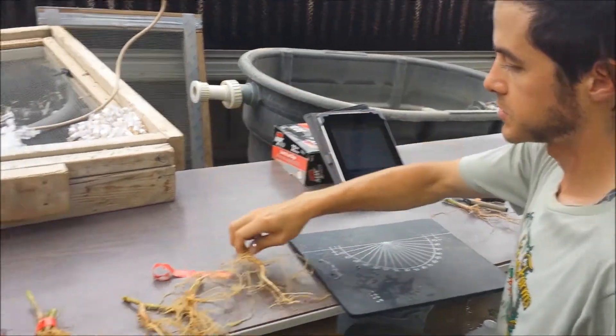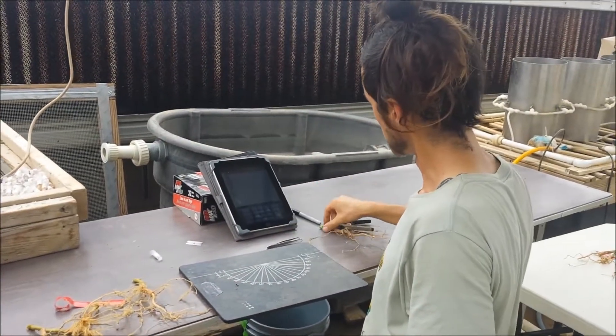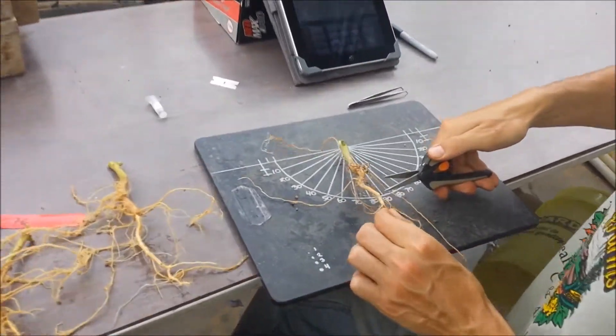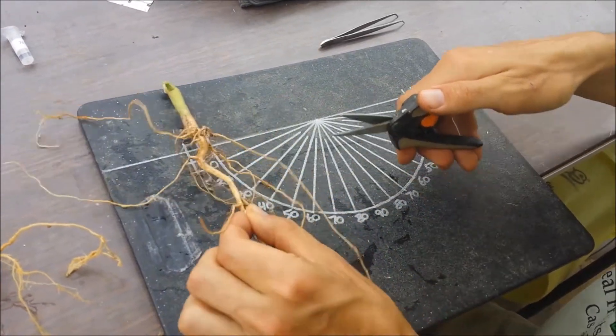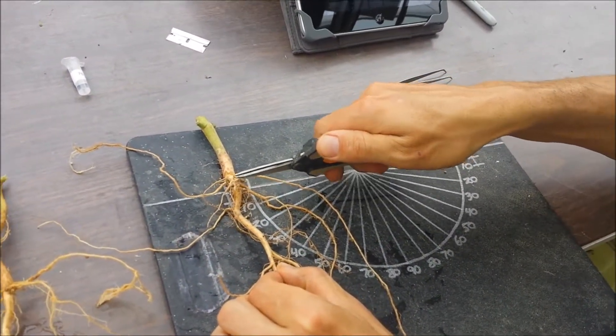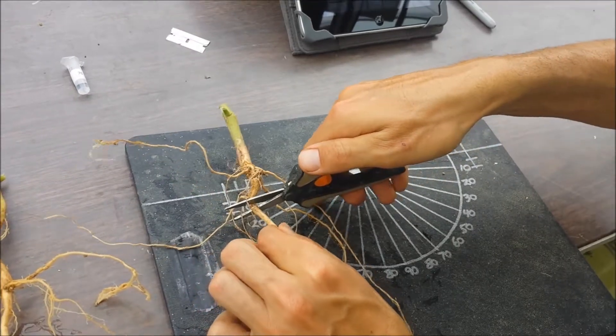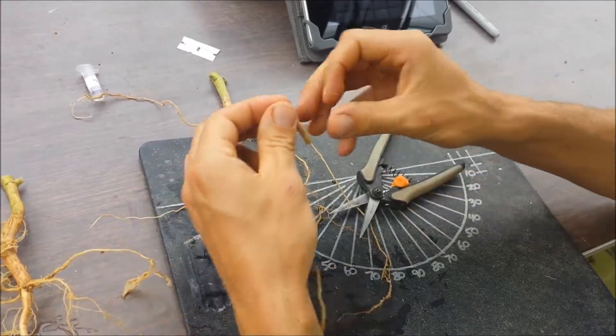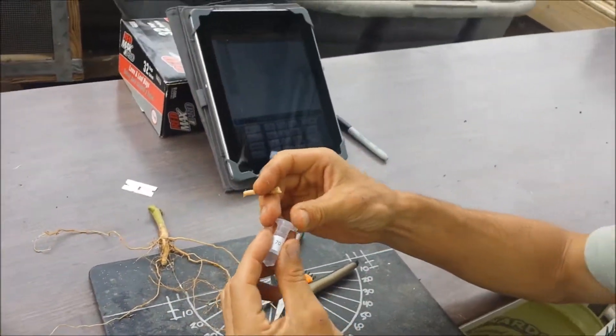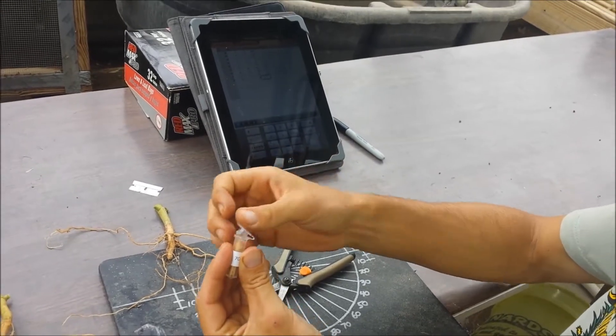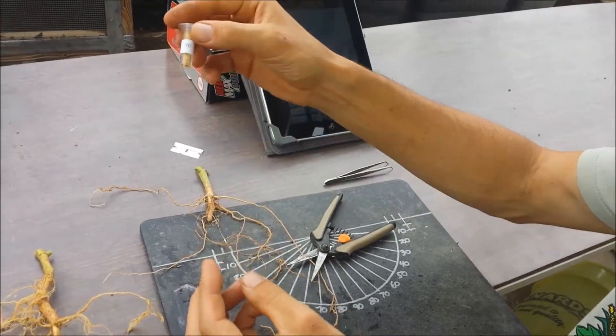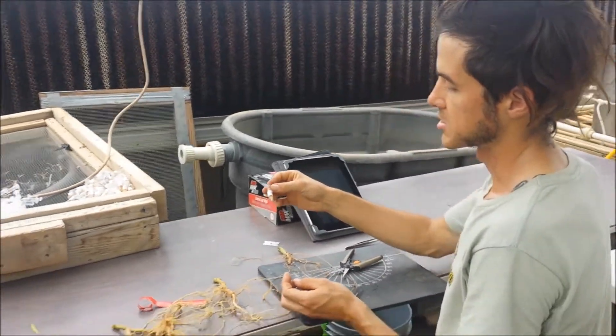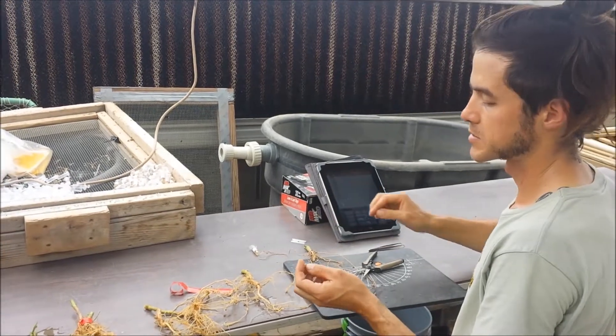Once we have taken those measurements, we can collect an anatomical sample. I usually try to get a sample about two centimeters below the point where the basals emerge and simply cut. Usually a two centimeter segment, because that's the size of our tubes. Throw that in there, and then we can use that later on for analysis, either with the laser or with hand sectioning and camera mounted in a microscope.